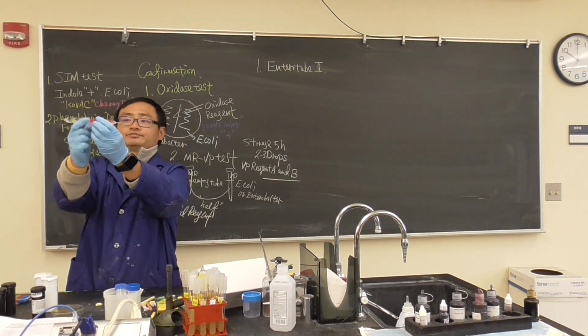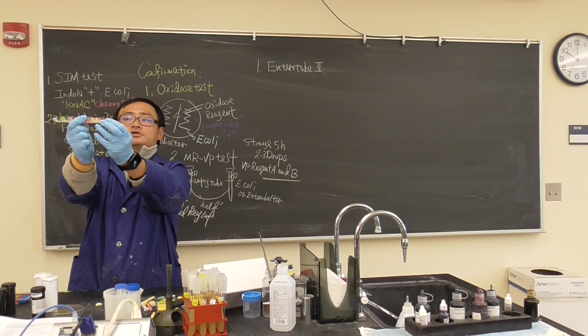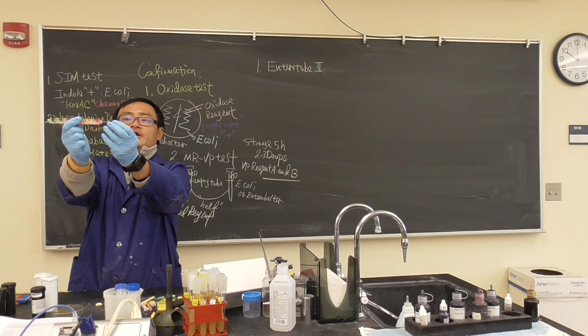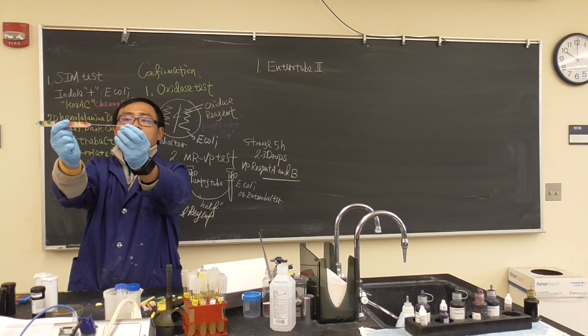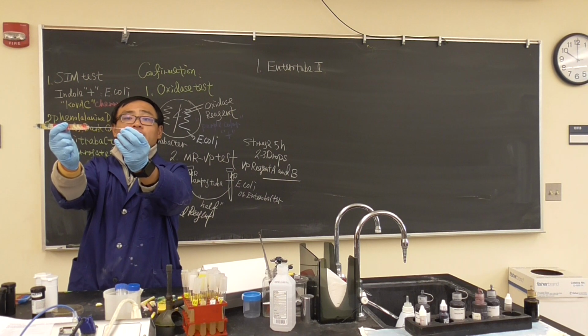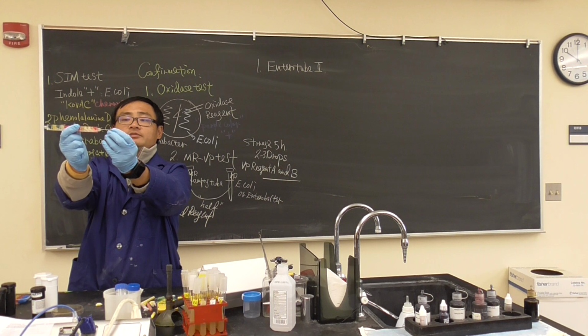And then I go through the whole well, very gentle. Don't take it out. If you take it out, you can't put it back, because it's contaminated with bacteria in the air. So very gentle, and put it back.